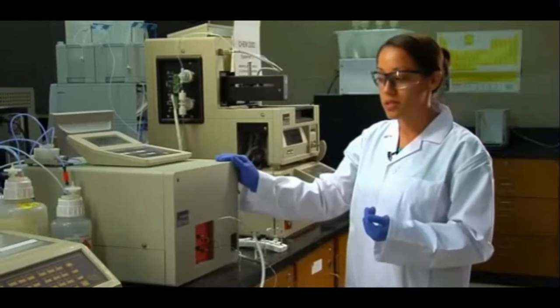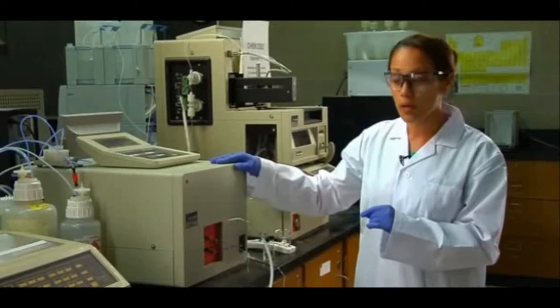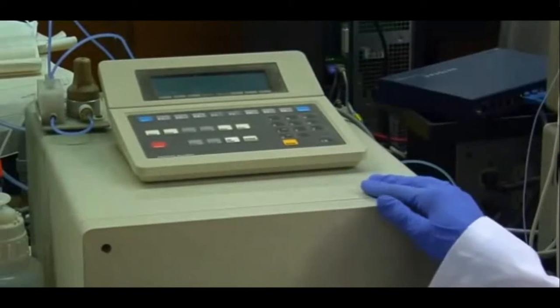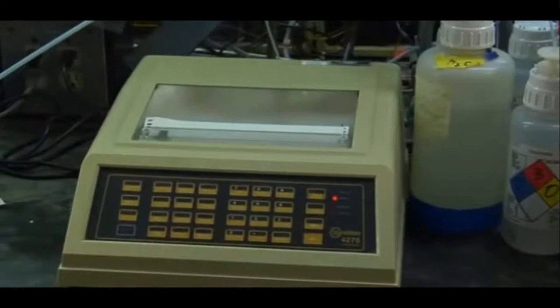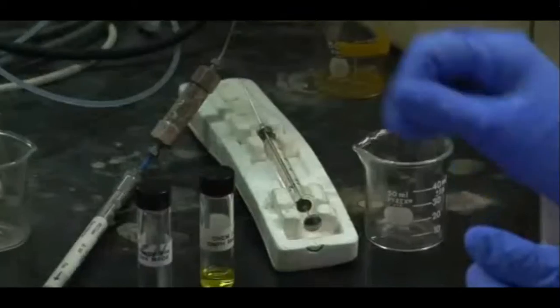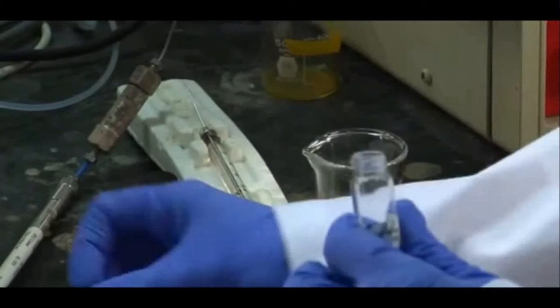Some other forms of HPLCs will be connected to a computer or you have some software, but this one is connected to an integrator, which is kind of old but very rugged. I'm going to show you quickly how to do an injection, and your chromatographs can take from five to ten minutes.